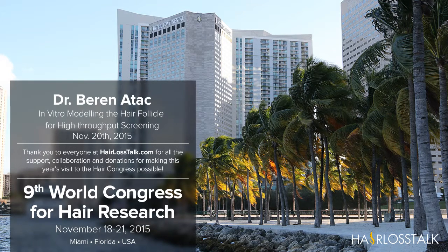But now, if we go back to the hair follicle. We are working with primary cells from humans, so we need to expand them. It's not like we can take as much as we want, like we might have the chance with mice. So we isolate the dermal papilla and expand the cells in 2D, which we know makes them lose their ability for inductivity, or reduce it, say, and also melanocytes. For this study, we used skin melanocytes, by the way, and outer root sheath keratinocytes from the hair follicle.